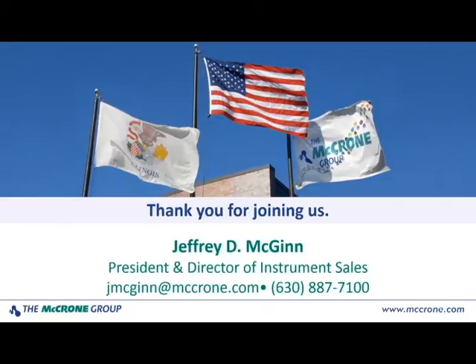That's a good question. From Andy, what does the full-size SEM have that the JEOL does not? Along the same lines, it's really more the magnification capabilities. Resolution as well, obviously. As I mentioned, the resolution on the NeoScope is near 15 nanometers, and you can certainly achieve much higher with a full-size SEM. Andy also followed up with the accelerating voltages that are available. Again, on the NeoScope, they're 5, 10, and 15 kV. It does high and low vac.